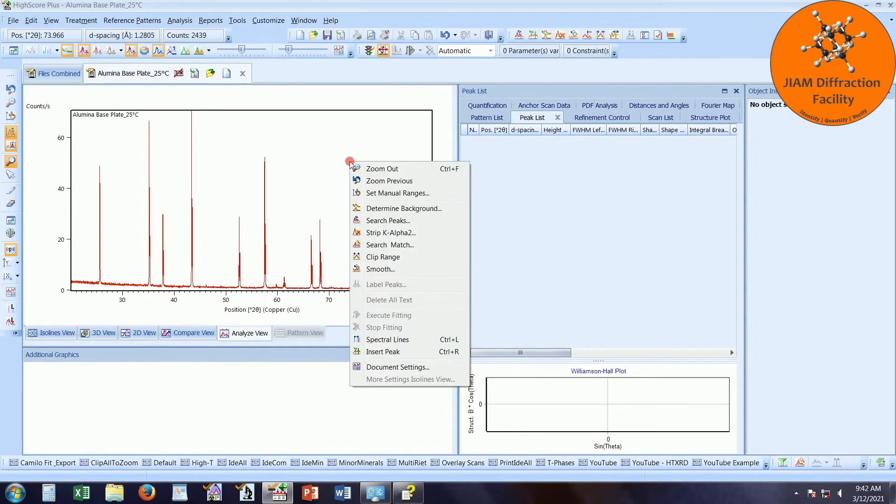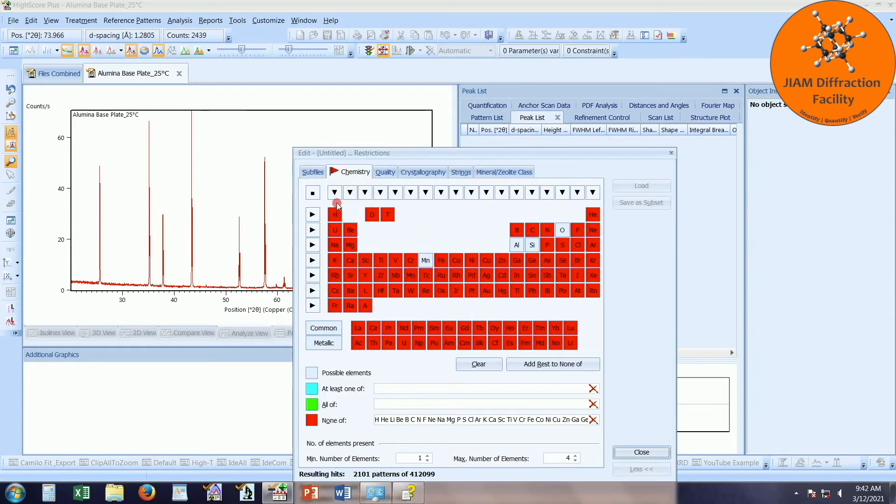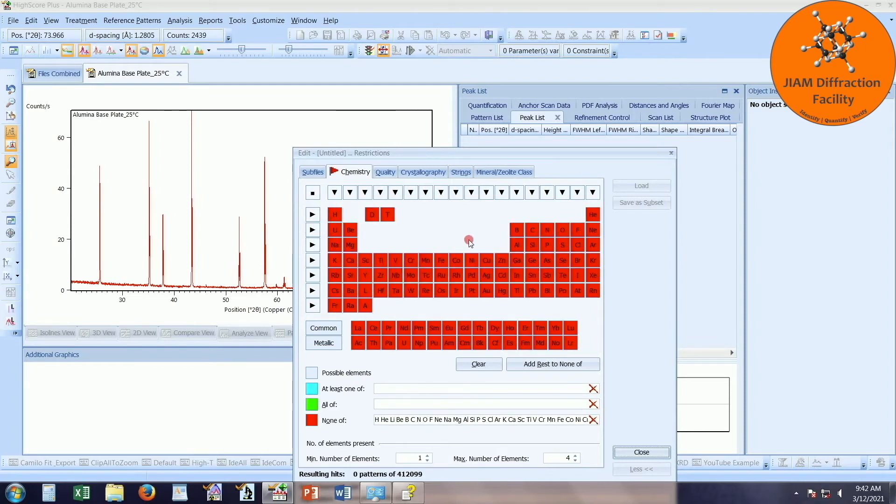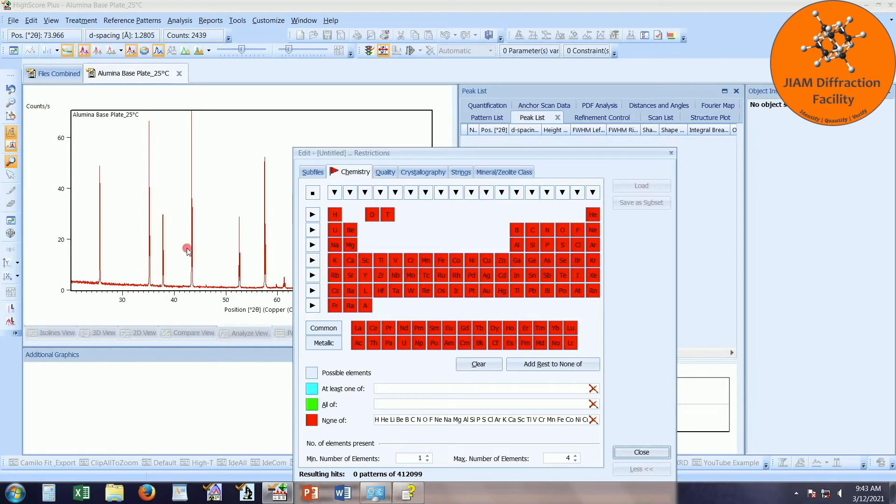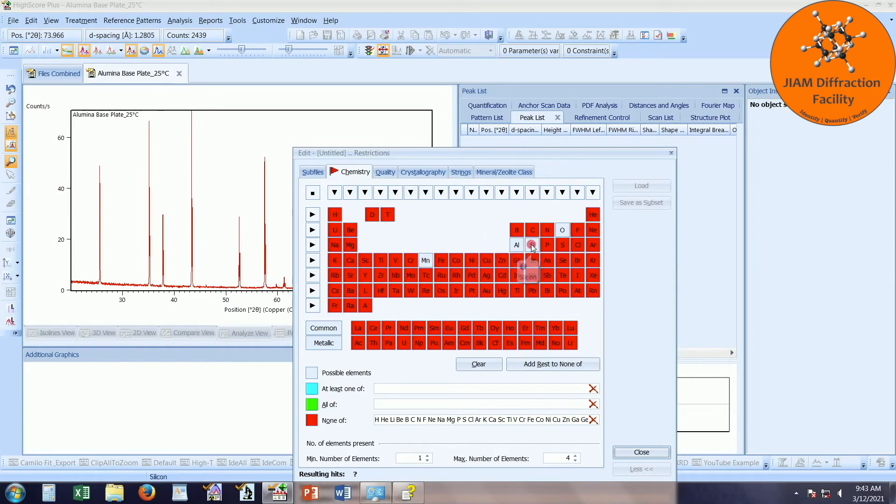And the last thing we have to set up for basic phase identification will be the search match. Let me start with the restrictions tab. I will edit that. And typically, I will come in here and click this button to make everything red. And then what you will want to do is choose whichever elements you know are in your data files that you have loaded into this HighScore Plus file. I know one data file has aluminum and oxygen in it. The other one has manganese, silicon, and I already have oxygen. So that's fine. For basic phase ID, this should be good enough.